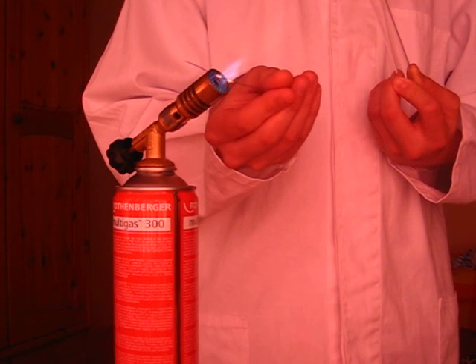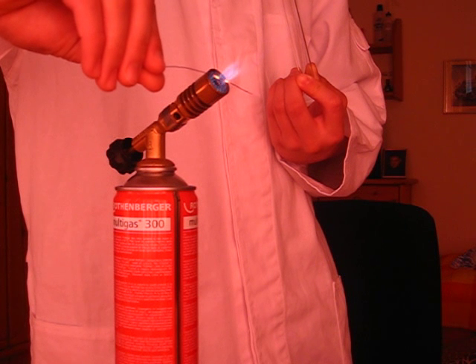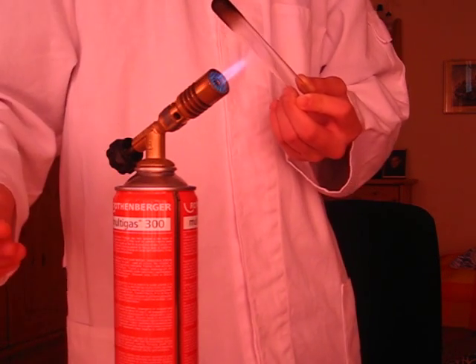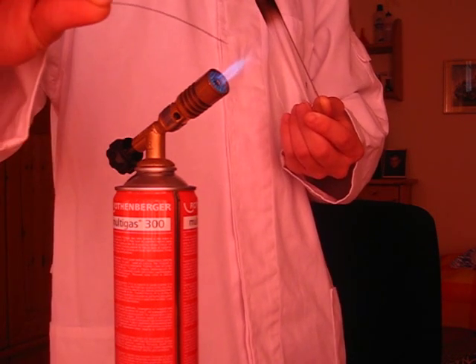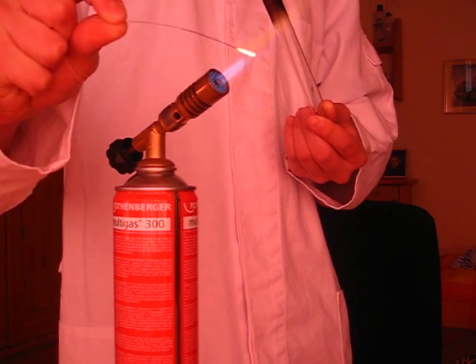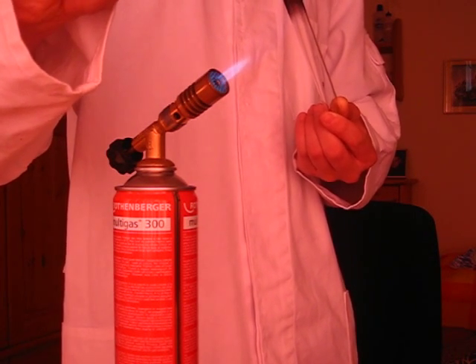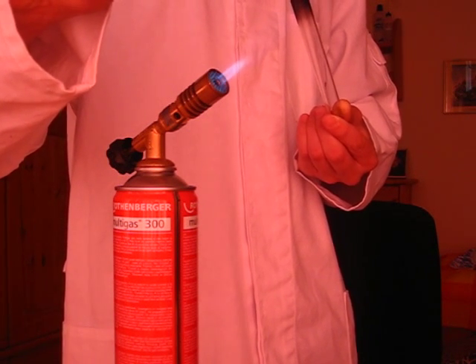The wire glows in two parts. As you see here, two parts. If you want to use the hottest part, you have to turn the wire directly into the oxidation zone, and you can see it glows red hot now. And if you have it too high in the flame, it is cooler. There's no effect as in the oxidation zone.